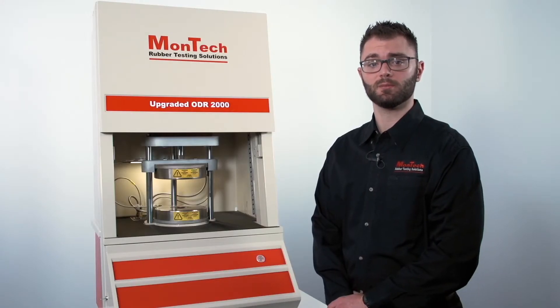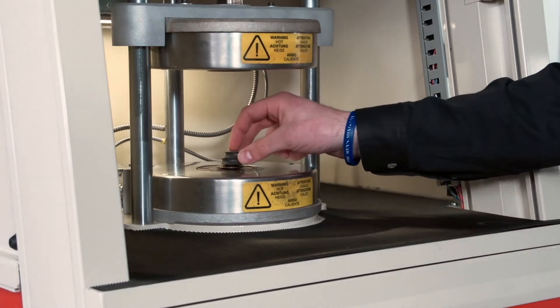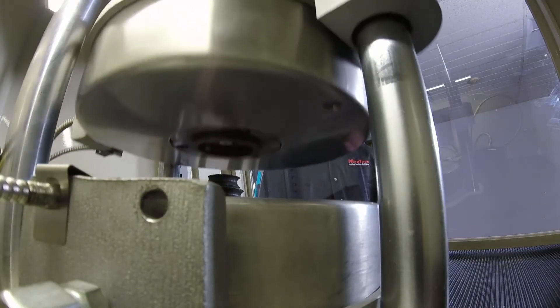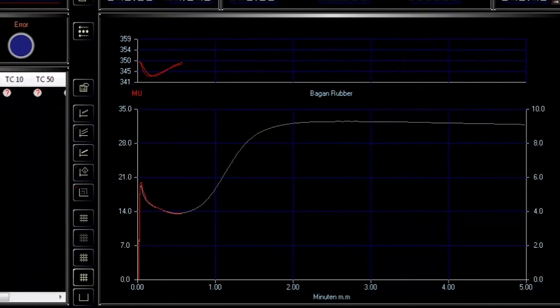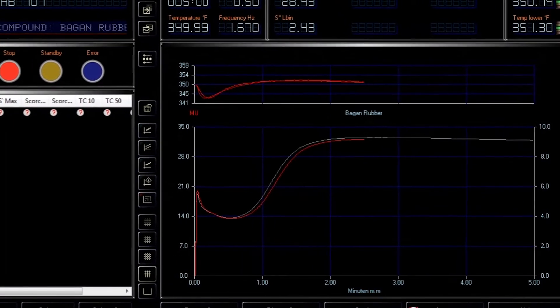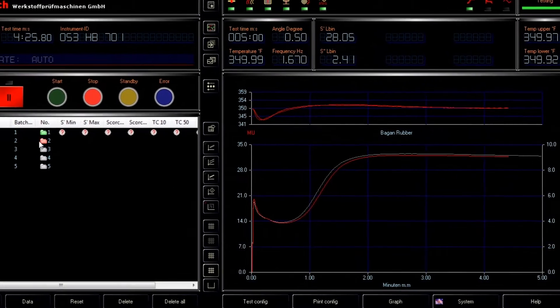Running a test with your Montech upgraded instrument is easy — all you have to do is cue the test, load your compound, and press the start button. Montech is designed to meet modern testing needs and comes with a large variety of test methods that can be easily selected from a pre-loaded list, allowing new operators to start testing within minutes.